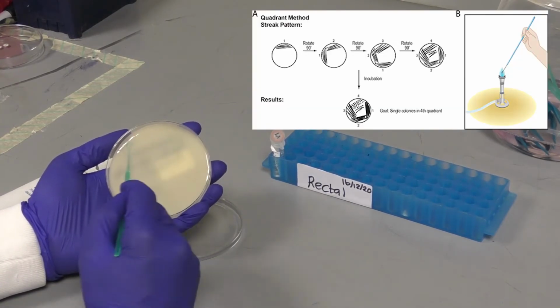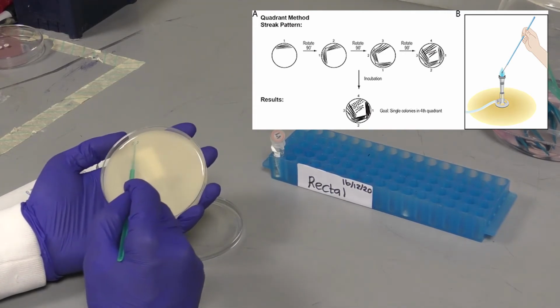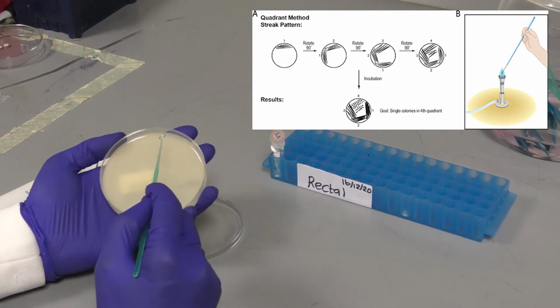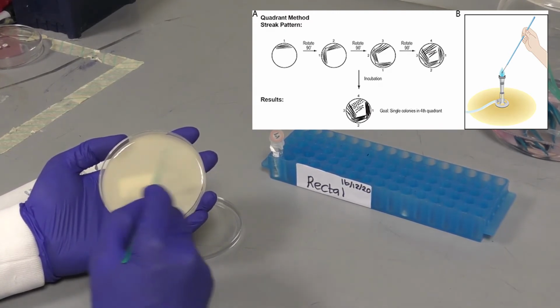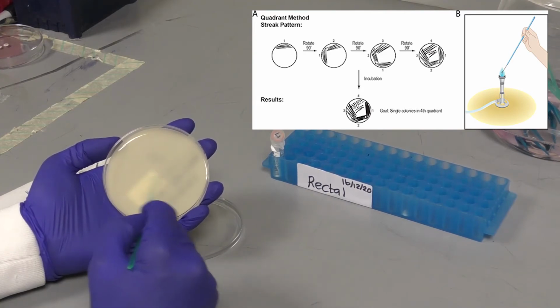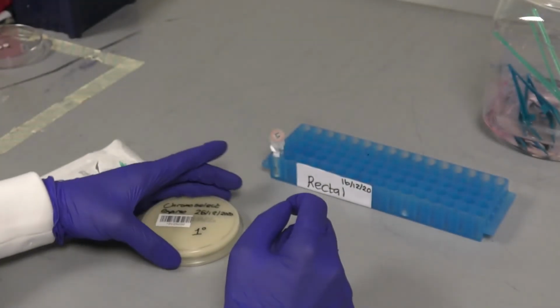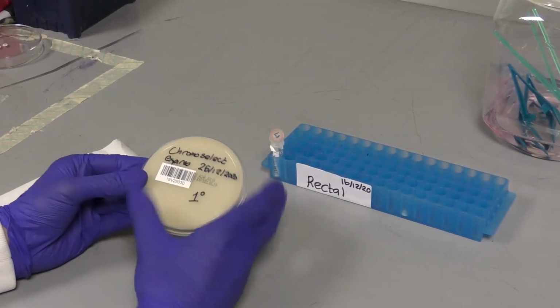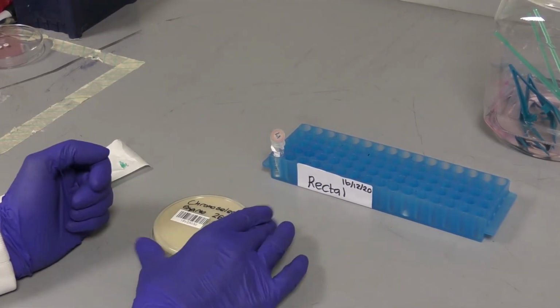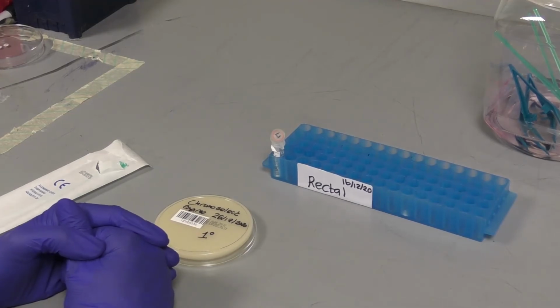Streak 1, streak 2, streak 3, and then streak 4, your final streak to ensure single isolate dilution. You'll then discard your disposable loop, if you're using one, into a 10% bleach container. This plate can now be incubated at 37 degrees in a standard incubator for 24 hours.